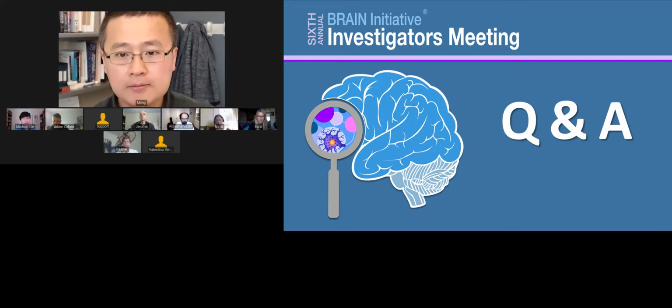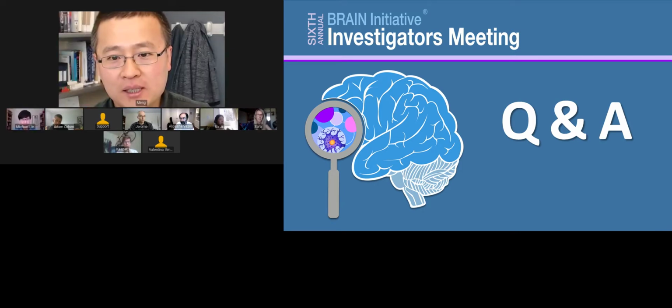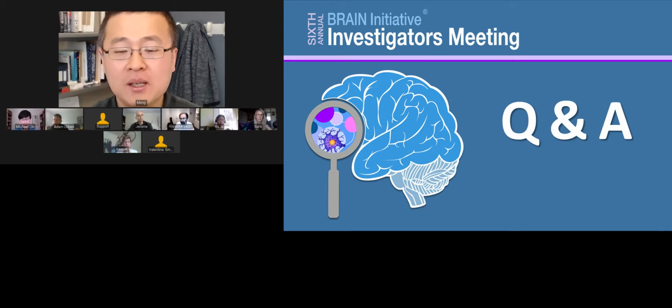Yes. Then, to follow up on that fundamental limit, you were saying it's less sensitive because you're collecting from a smaller area. But if you had a really big capillary, the size of a full width of a field of view, wouldn't that help? Yes, I think so. For some of the probes we listed, the size ranges from 350 microns all the way to 1 millimeter and 2 millimeters. If you can really push to 2 millimeters, then for example for monkey brain and larger animals, the collection will be rather efficient.